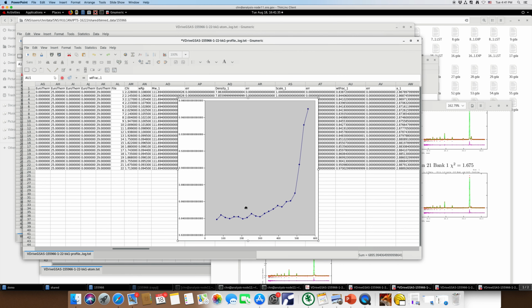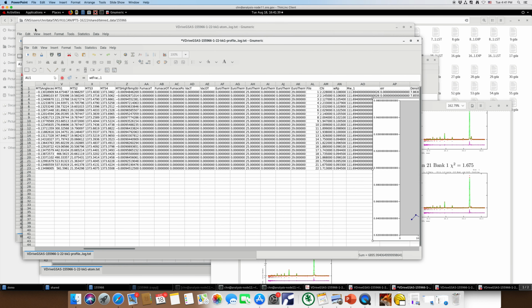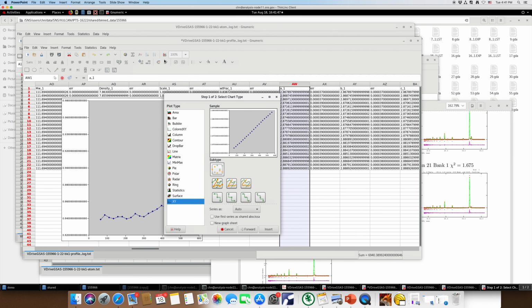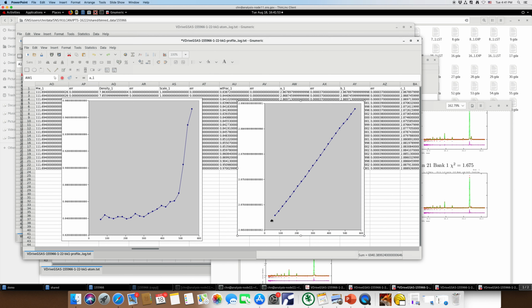And if we plot the temperature versus the lattice parameter, yeah, we can see that it's almost linear, but slightly bent during the phase transformation, and it may also include the process of the element diffusion between the phases.